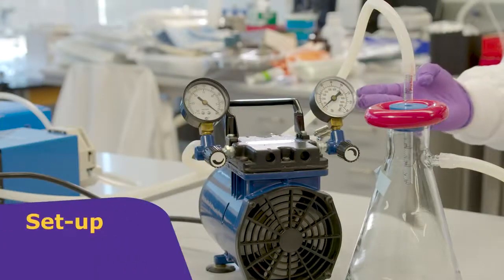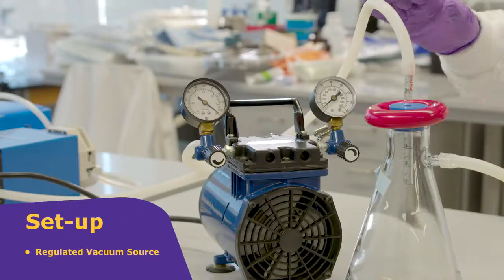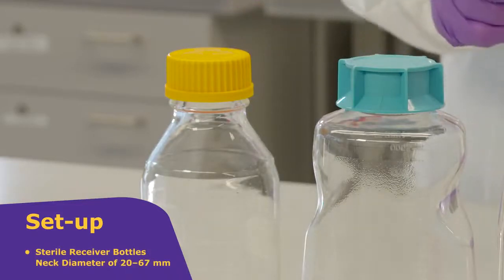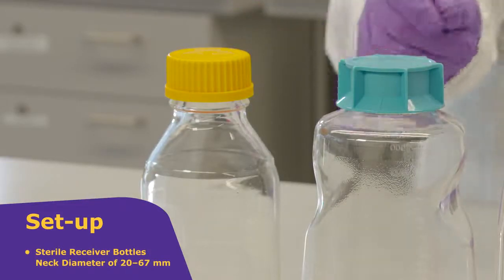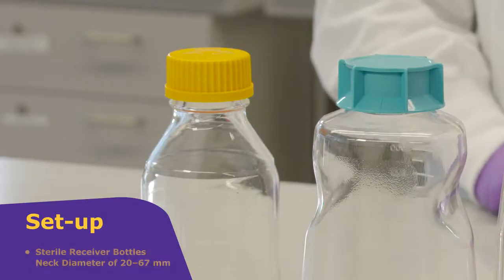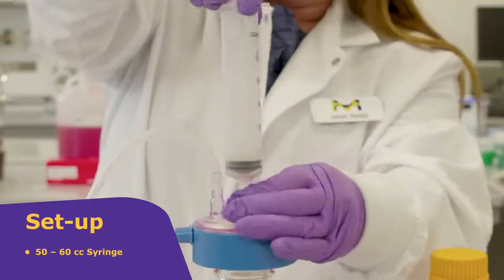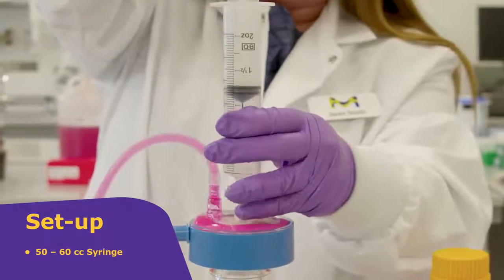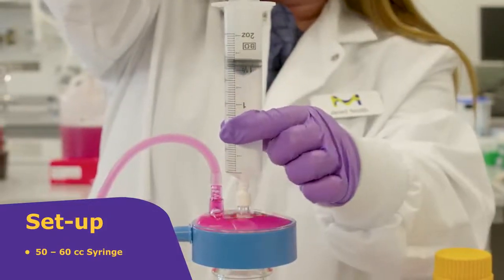Setup. You will need a regulated vacuum source with tubing, sterile receiver bottles or vessels with an inner neck diameter of 20 to 67 millimeters, and a 50 to 60 cc syringe can be used to reprime in the event of air locking.